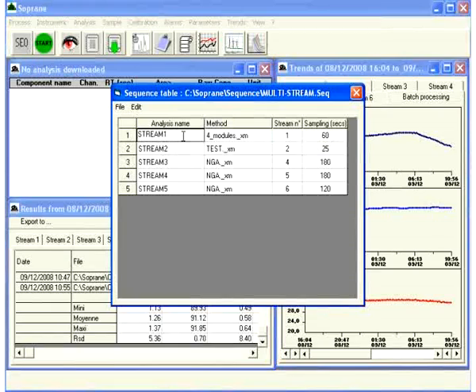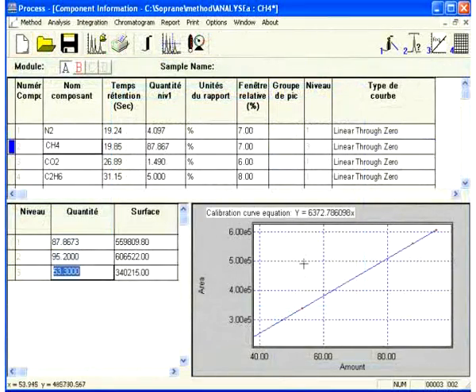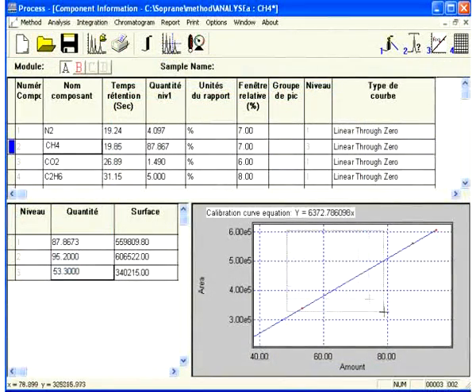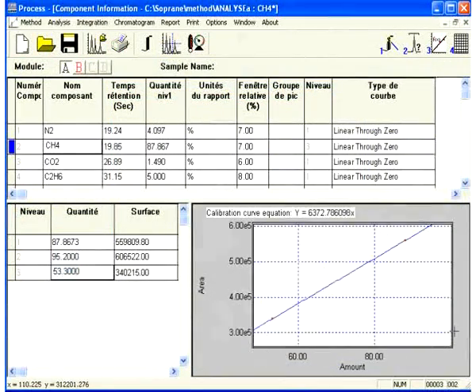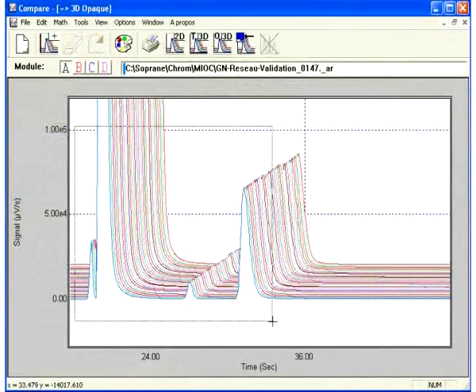Manage multi-stream analysis sequences. Offer intelligent multi-level calibration capability. Permit rapid detailed comparison of analysis results.